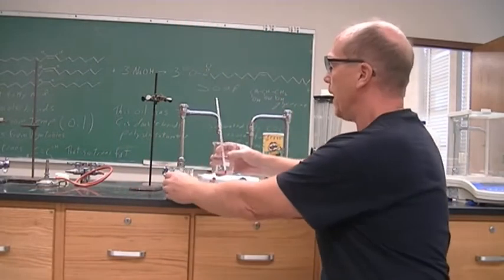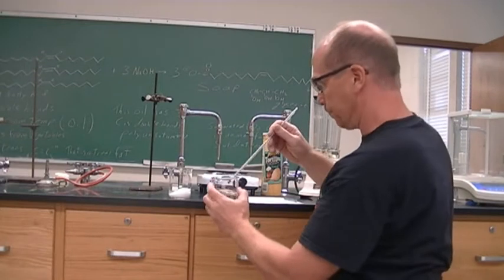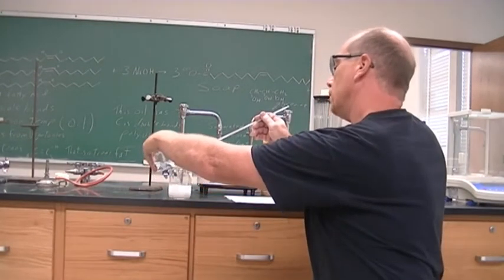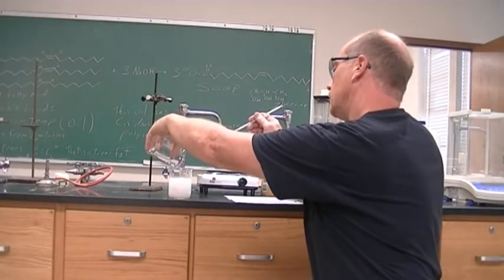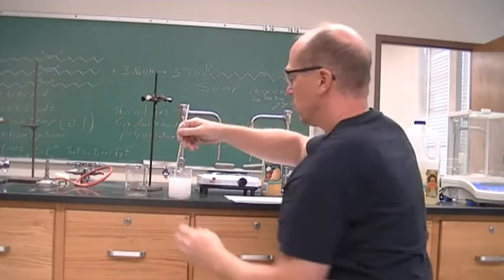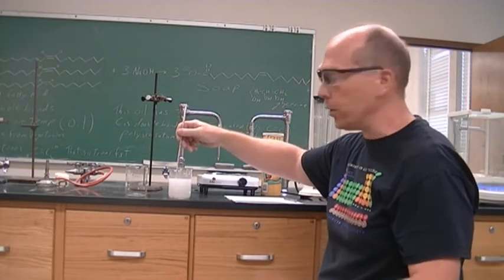All right, so I have the thermometer because this is very exothermic. I'm going to dissolve my sodium hydroxide with my water. And this is an alcohol thermometer, not a mercury thermometer.